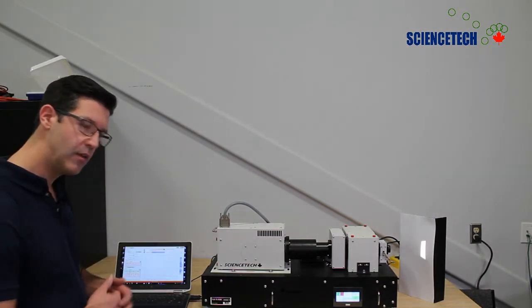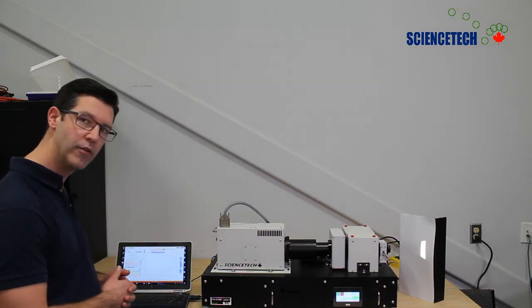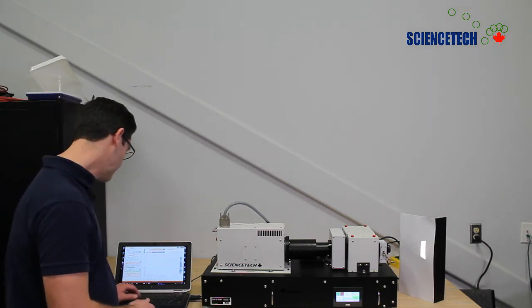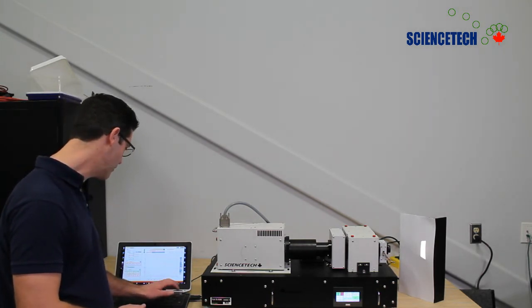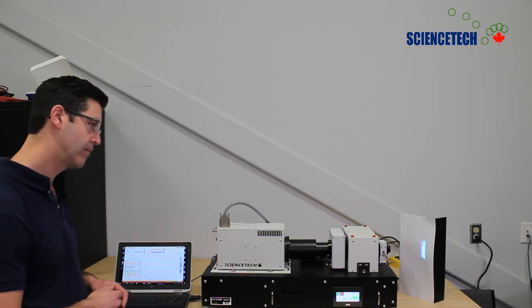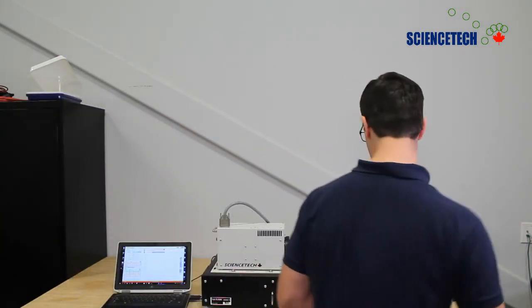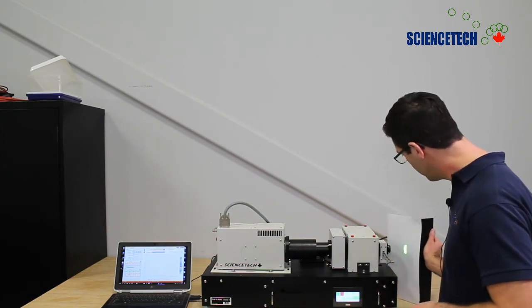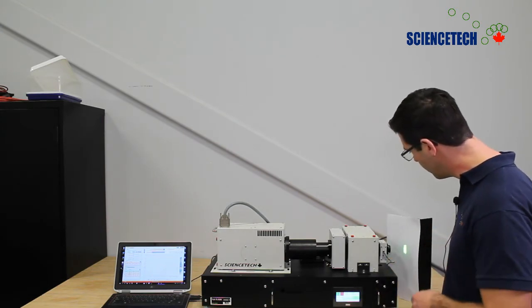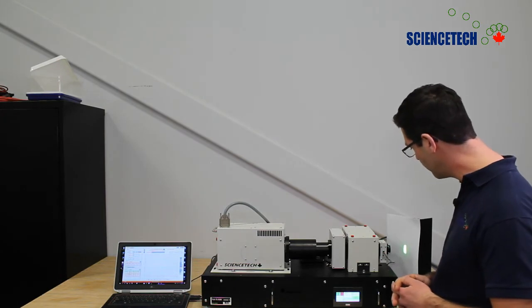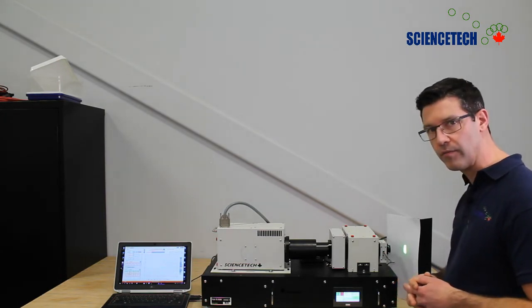So I'm just going to turn the monochromator over to a green wavelength. Let's try 550 nanometers. Alright, let's take a look at what it looks like. Over here you can see we have a nice bright, fairly uniform spot of light coming out of this system.